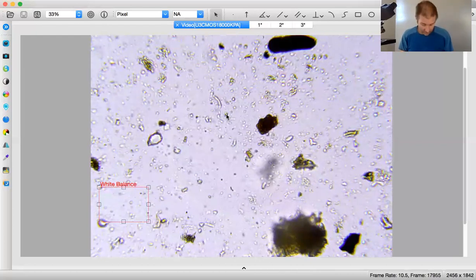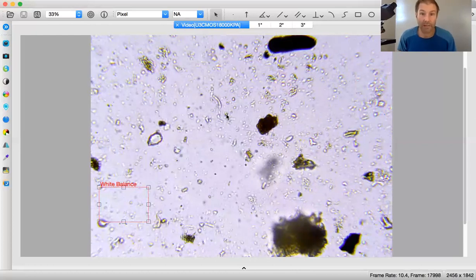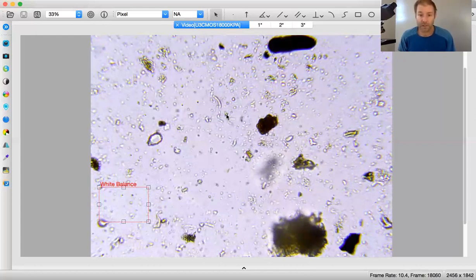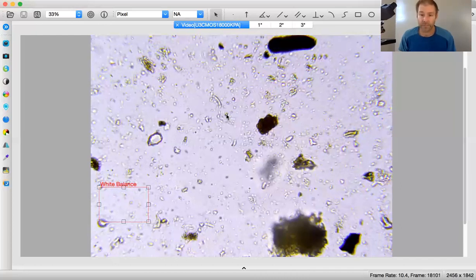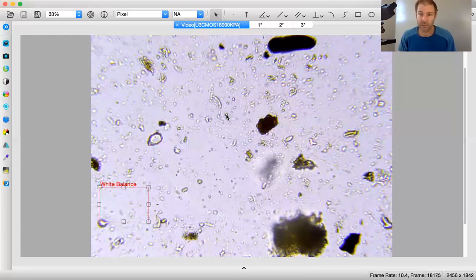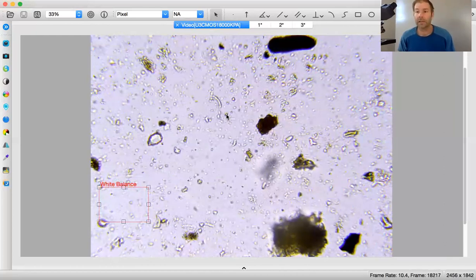All right, well, it was off to a great start, guys. Thank you so much. I appreciate you listening if you're watching this. But there's nothing we can do when the sample dries out. It was my fault for looking at a few things before I started the assessment. I just wanted to make sure that it had the organisms in it so I wouldn't be wasting my time narrating and making my MPA3.